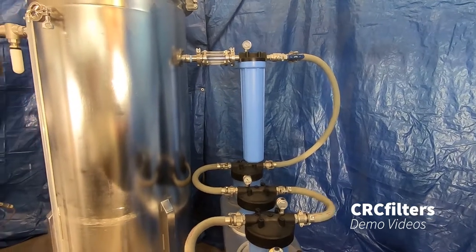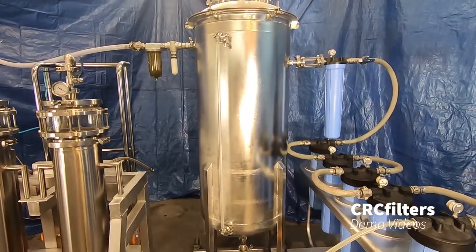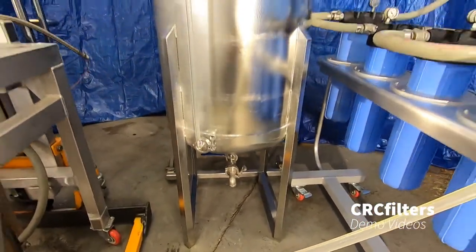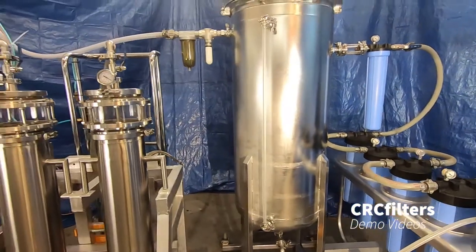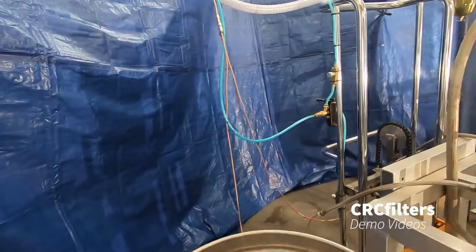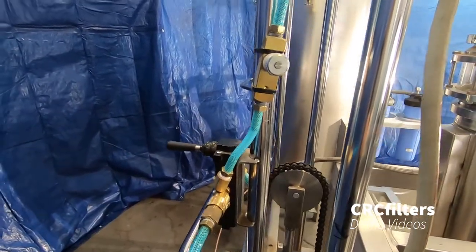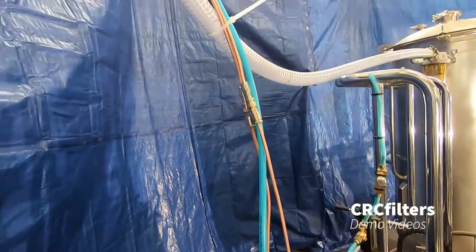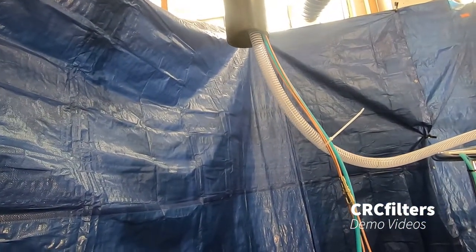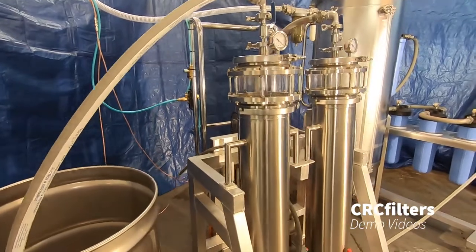There on the tank we have a 100-gallon — 80-gallon working capacity — vacuum storage tank with the drain right here on the bottom. One of the cool things about this is the pneumatic operated lift. We've got an air-powered lift here. You can see the up and down switch. All the lines — vacuum lines, ultrasonic lines, and air lines — we run overhead to keep them away from the hazardous area. Those are the basic components.